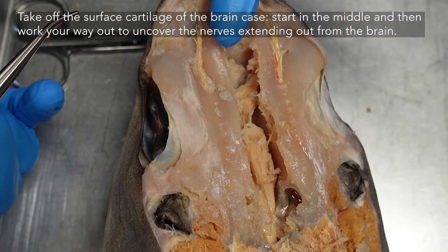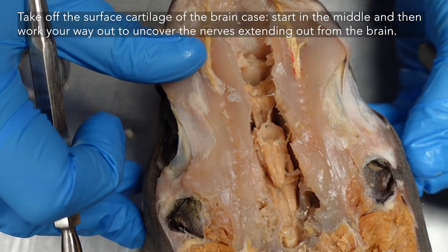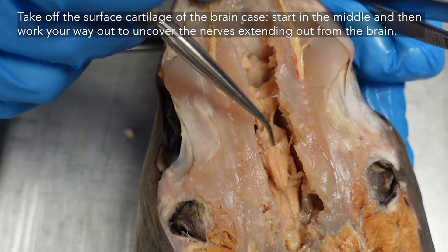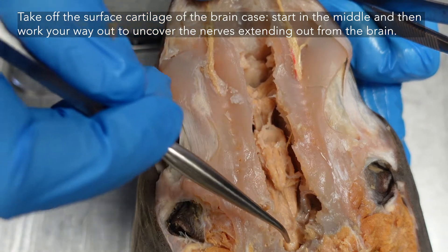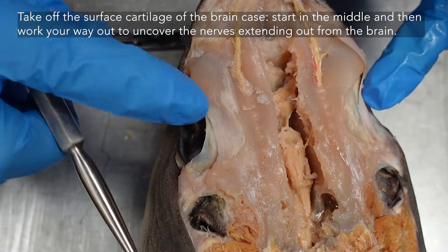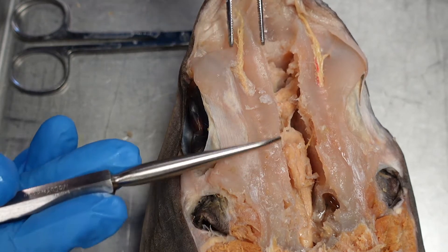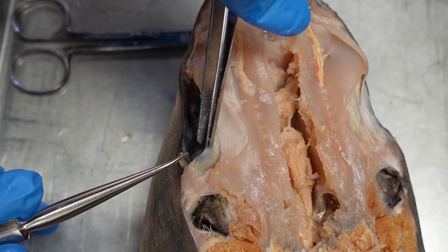Now that we've cut the main channel into the shark skull, we can see the main parts of the brain. Looking down here we can see the cerebrum, the cerebellum, the auricles of the cerebellum on either side, and the medulla oblongata. From here we'll work our way outwards. You only have to do one side of your shark, and when dissecting you're essentially removing all of the covering cartilage.